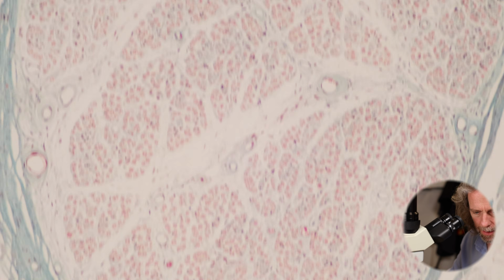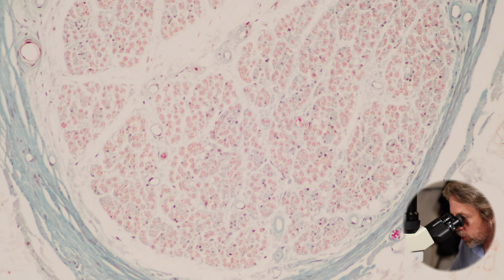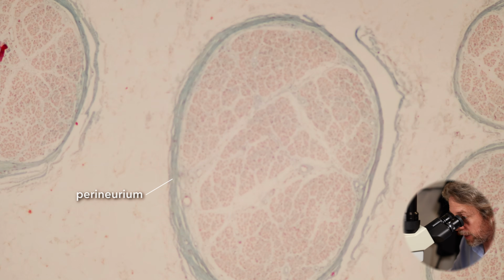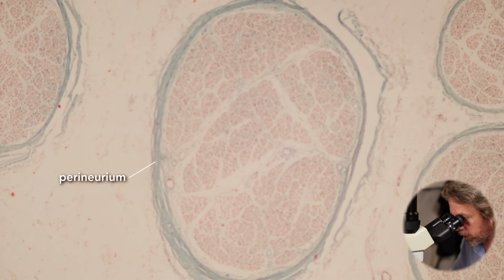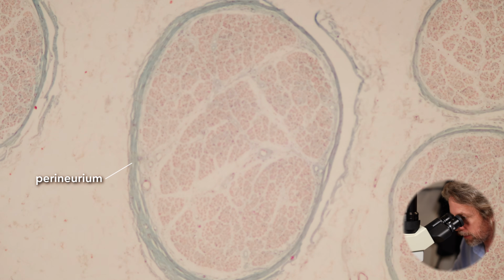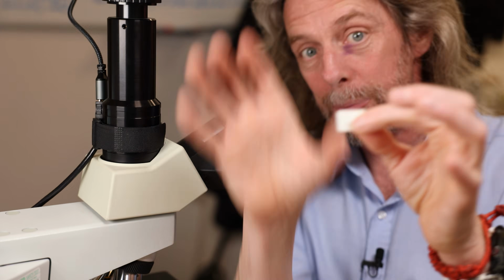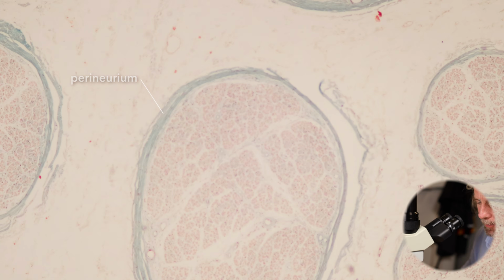No, not quite. But you can see that we've got those neurons surrounded by endoneurium bundled together by another layer of connective tissue. So this green layer of connective tissue we can see here, making that circle we saw at the beginning, that's perineurium. And then, I can't actually zoom out far enough, but then all of those bundles are bundled together with another layer of connective tissue, which is the epineurium.